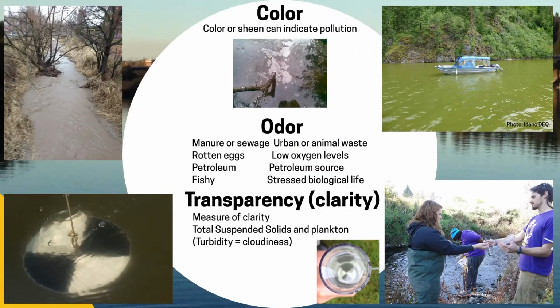In standing water, we use a Secchi disc. This is an 8-inch wide round weighted disc tied to a rope marked at 1 meter increments or a measuring tape. You lower the disc into the water on the side of the boat away from the sun and waves. You wait until you can't see it at all, and then you mark that depth on the rope. Maybe use a clothespin or something.